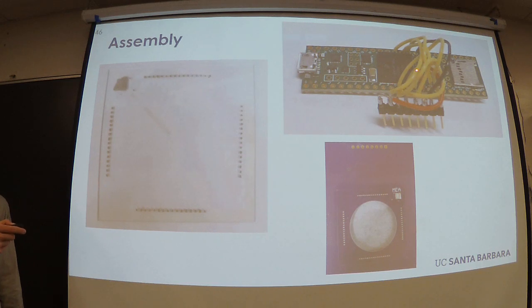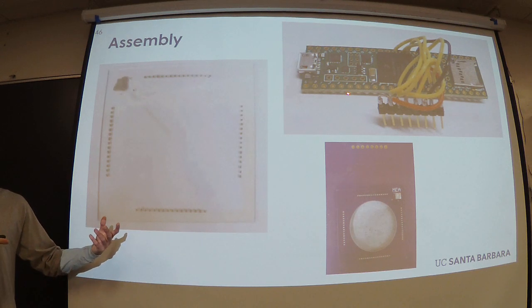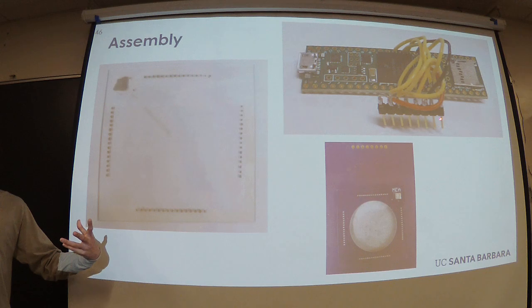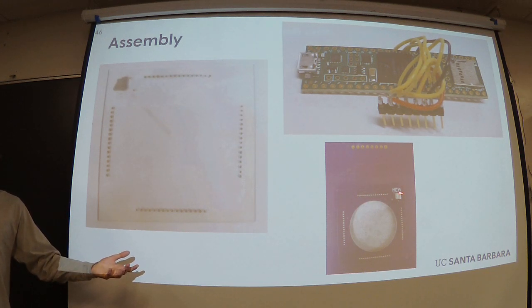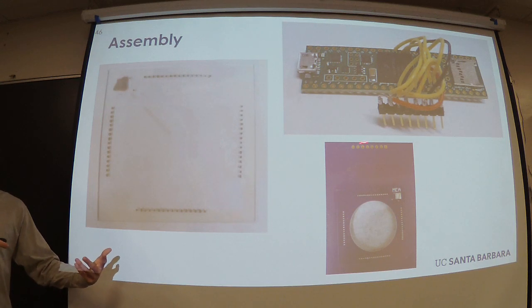And then here is the microcontroller, which I've soldered all these things to this connector, and this connector plugs into this part of the PCB, so that you can have this modular system where you can have this microcontroller connect, and you can run your experiments with it, and say you build five or six of these systems, you can run five or six experiments in parallel with one microcontroller.